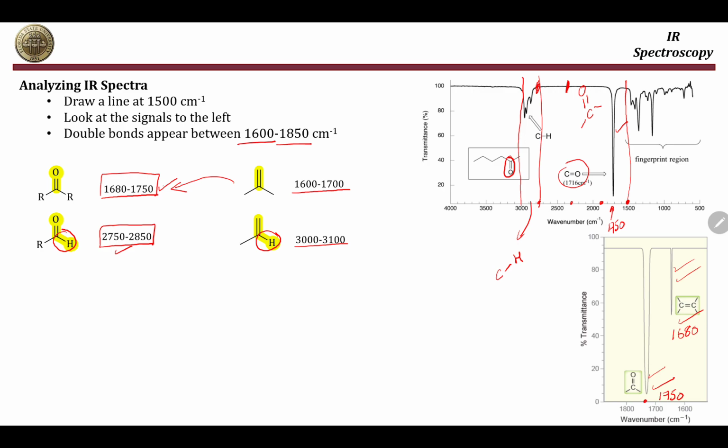And since all organic compounds will have carbon-hydrogen bonds, you will always see peaks in this area. So this area usually doesn't give much information. So we only look at the peaks which are below 2800 and after 3000. Those are the ones I will be looking at, most of the time, to identify the different types of bonds that exist in a compound.